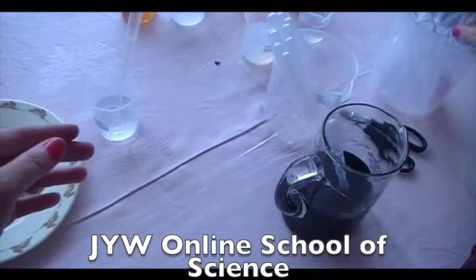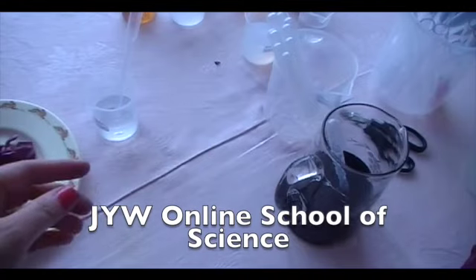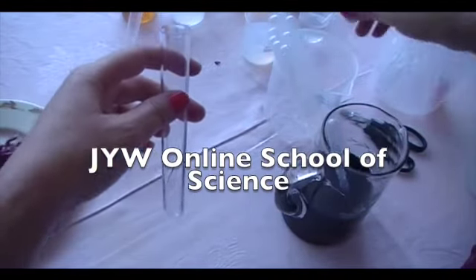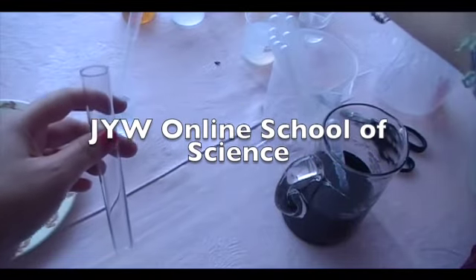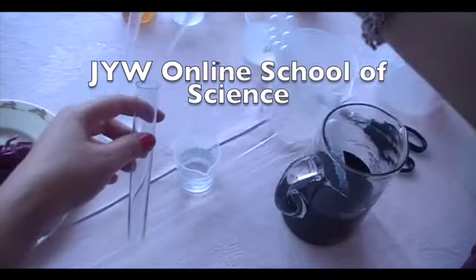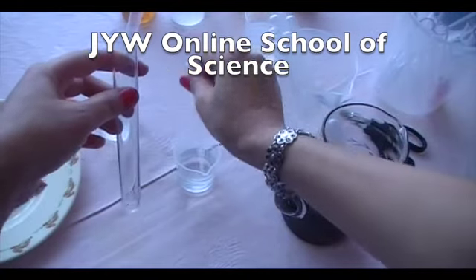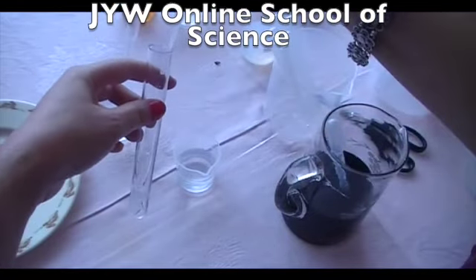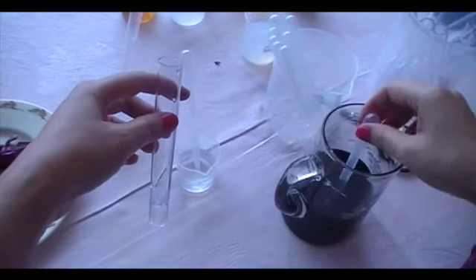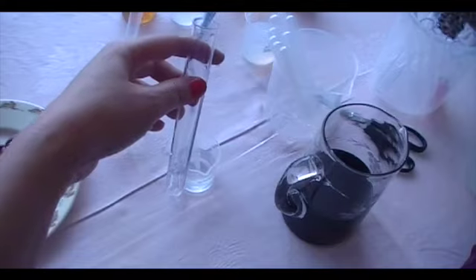Say if I have a bit of water, for instance, it's neutral. This one is water. And then I'm going to add the red cabbage solution into it.